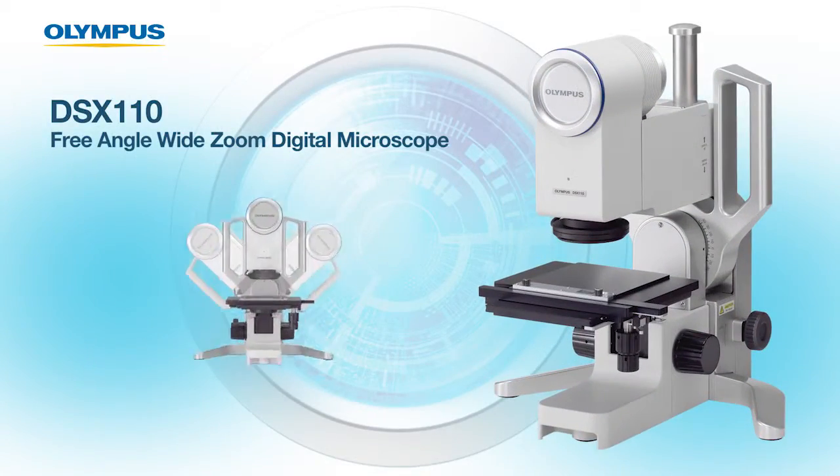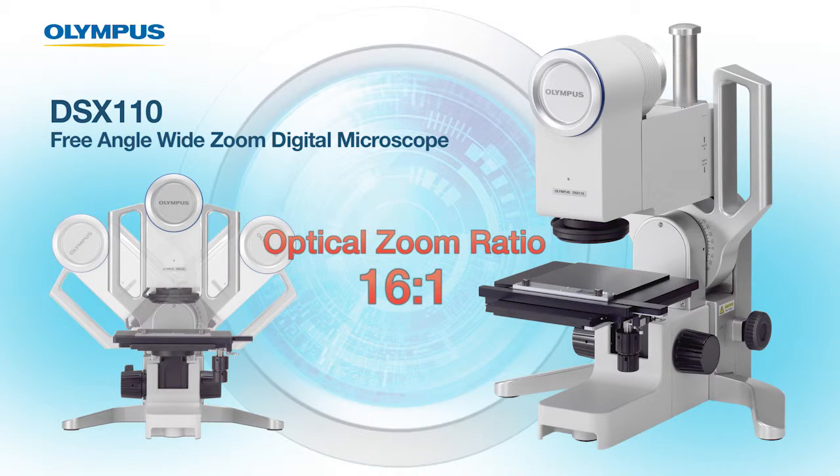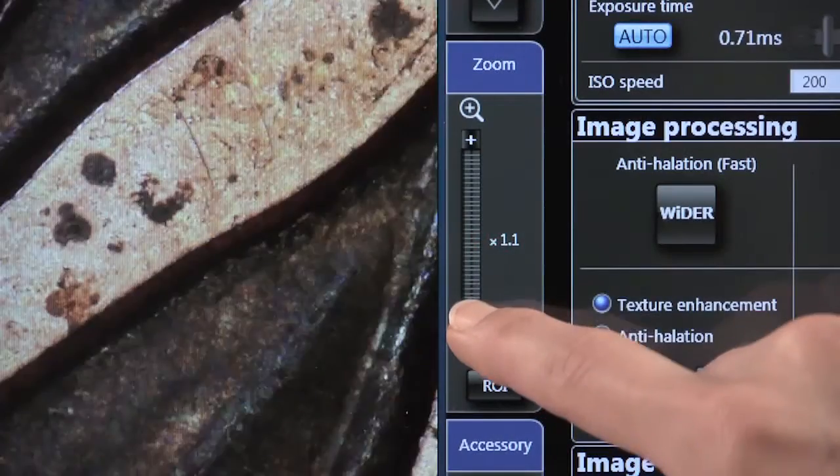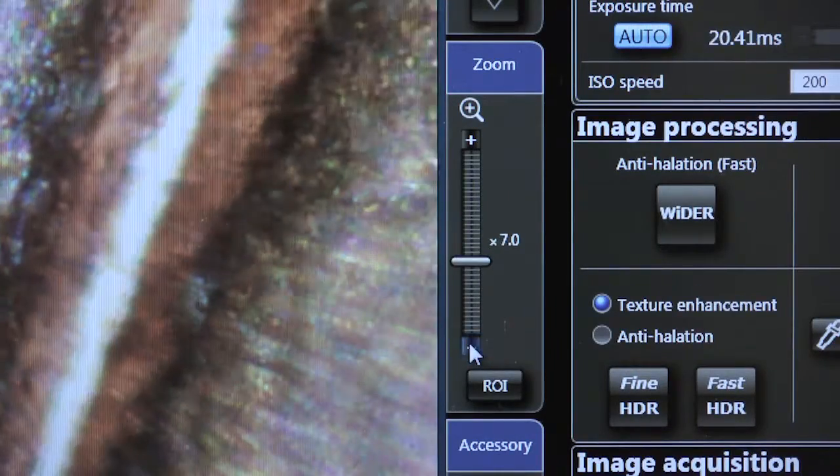The DSX 110, which is Olympus' free angle wide zoom microscope, has an optical zoom ratio of 16 to 1. Changing the zoom is simple and can be done with a touch of a finger or a click of the mouse in the software. There is no need to touch the microscope to change the zoom.